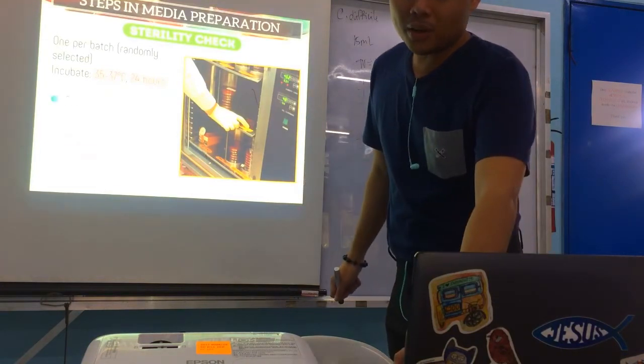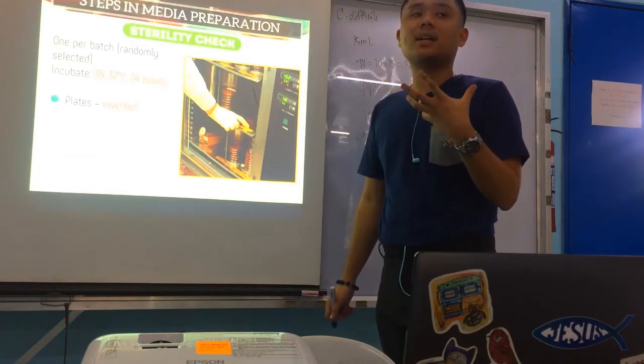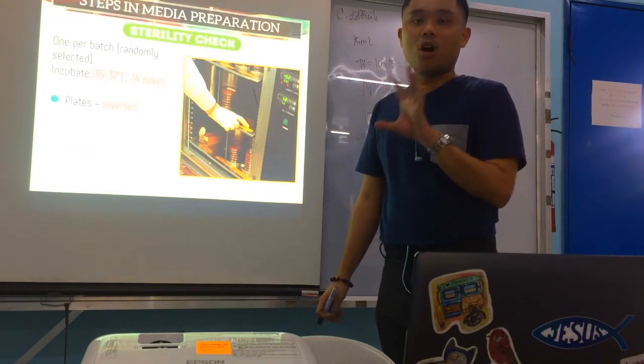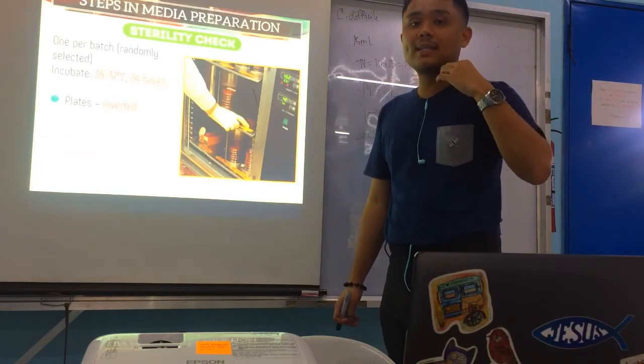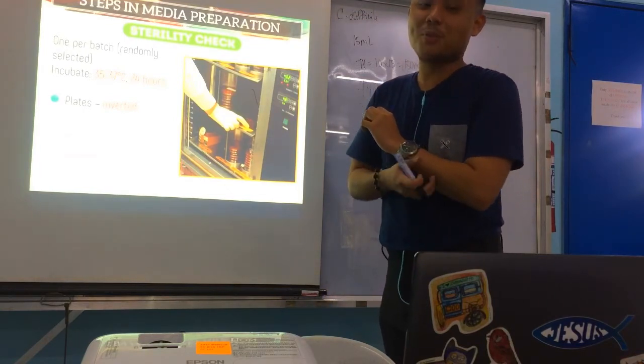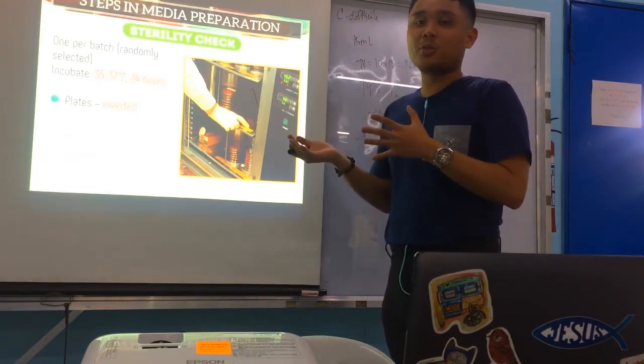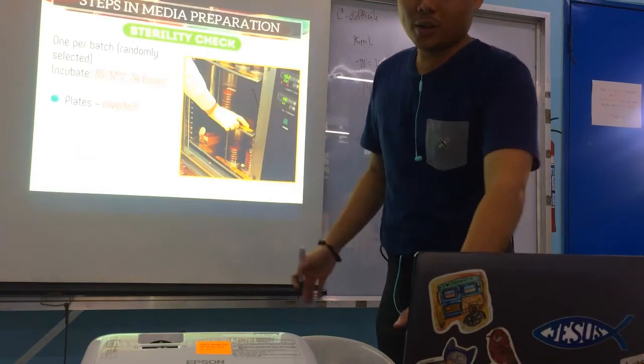Now, after 24 hours, if there is growth on that plate or tube, then it means all of the culture media that you made is contaminated. So you don't use them. You dispose of all of them. But if there is no growth after 24 hours, then it's sterile. You can use it. Okay?